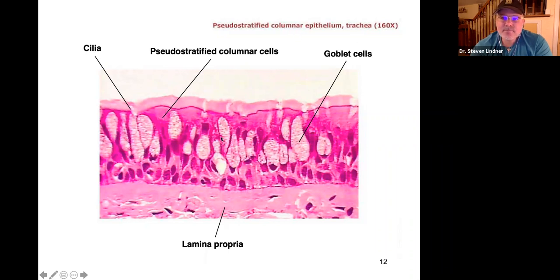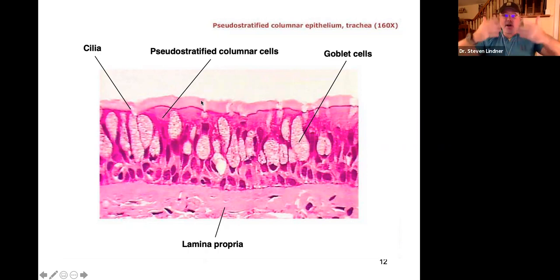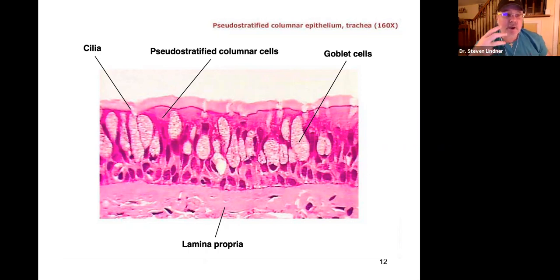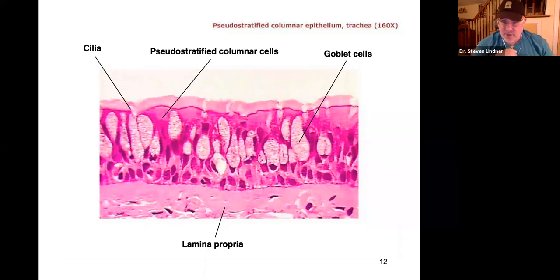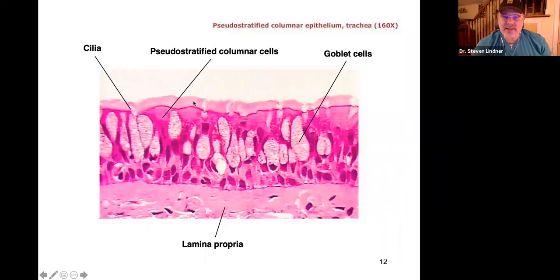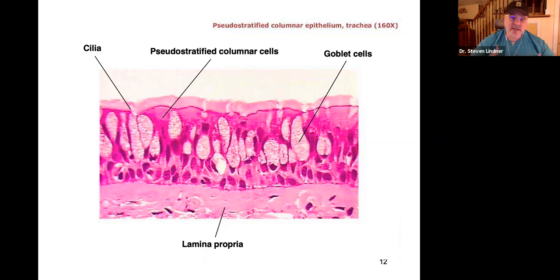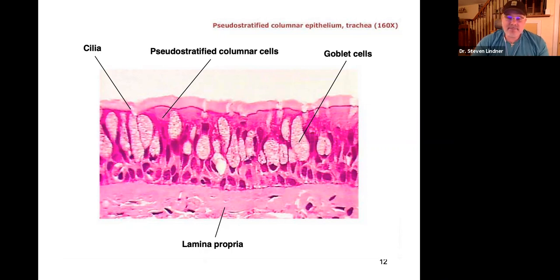In the trachea, goblet cells produce mucus that sticks to the cilia. The cilia beat from inferior to superior to prevent debris, dust particles, and toxins from traveling through the windpipe into the lungs. When people smoke, the smoke breaks down or paralyzes the cilia, leaving nothing to block carcinogens and toxins from reaching the lungs and entering circulation.